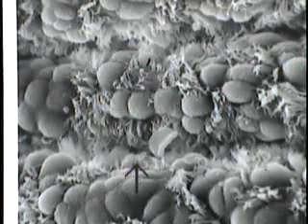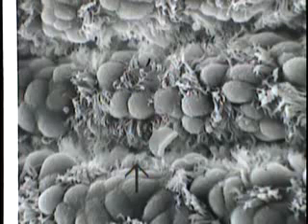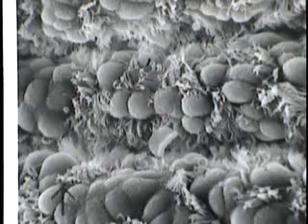This particular field is a scanning electron micrograph showing the mucosal surface as viewed from the surface of a small bronchiole. Here's one of the bronchiole folds shown here, and it's crossed by the arrow. The arrow crosses another one of these bronchial folds, and another is shown here.